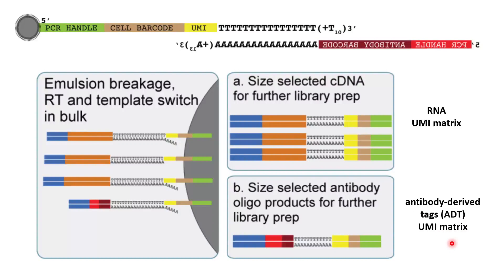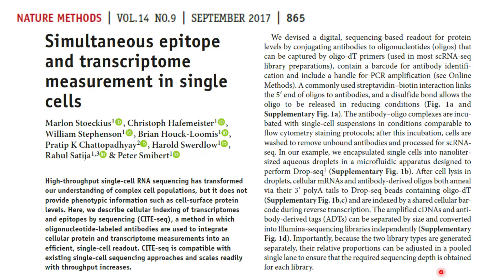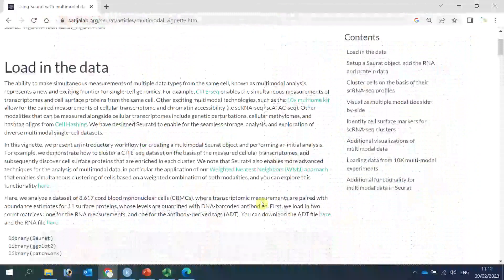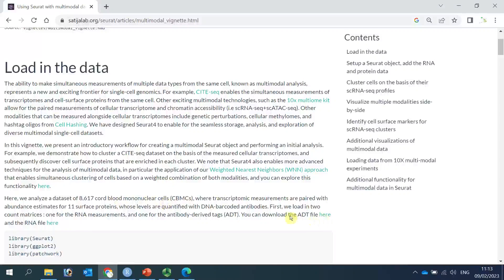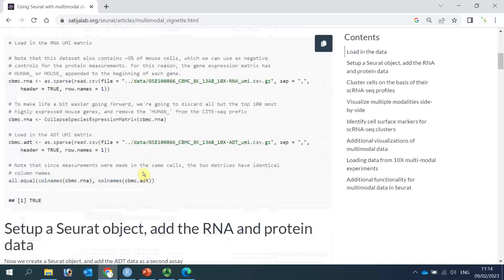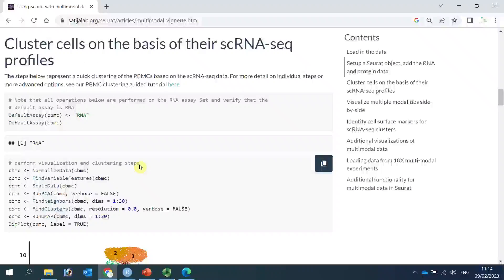That was a brief introduction about the CITE-seq method. If you want to know more details, you can read the original paper published in Nature Methods in 2017. I hope you understand where the ADT data comes from. I'm going to use a dataset of more than 8,000 cord blood mononuclear cells. You can download the ADT data and RNA data from the linked website, and I'm using the code from that website for today's demonstration.